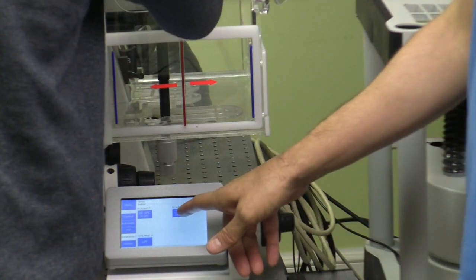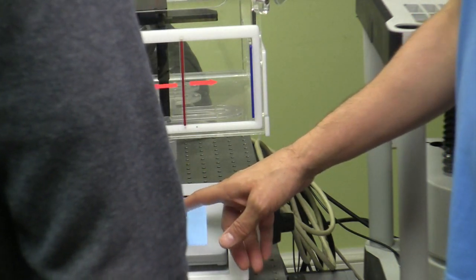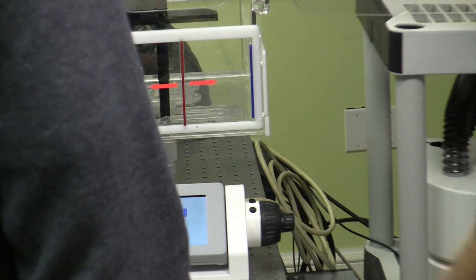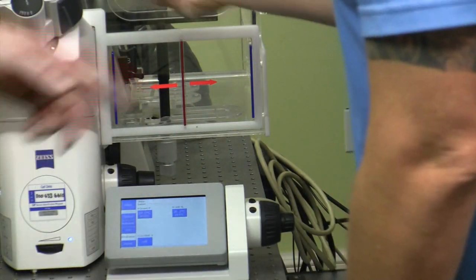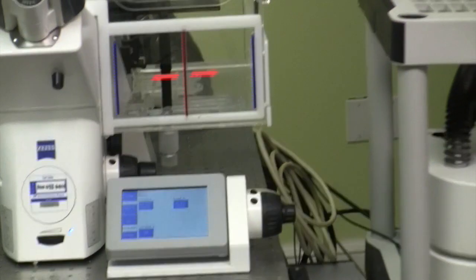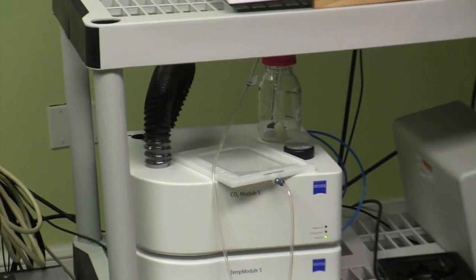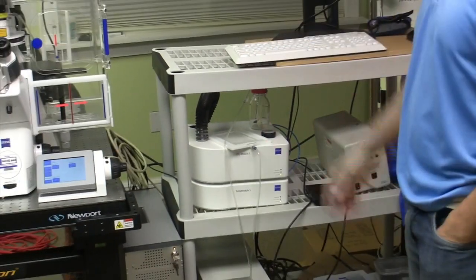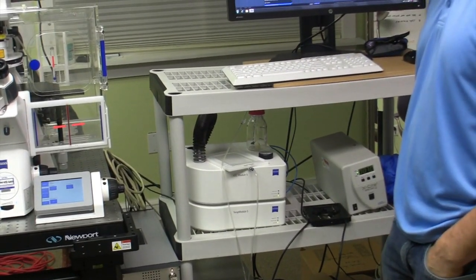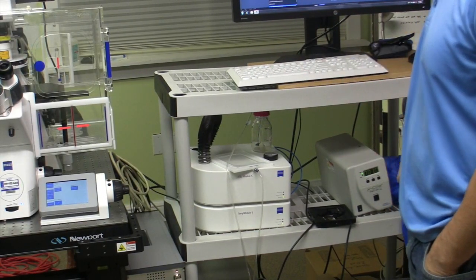It's set to 29.5, and it's been going up. It could take a couple of minutes to get to the total temperature, but it started at 18 Celsius and now it's at 26. And so what somebody would do with that incubator plate, I'm assuming, is take a live sample and then grow something on it. Yep. And there's a CO2 module, so you can keep your cells alive while you image them over the long term, like nighttime, over 24-hour experiments.